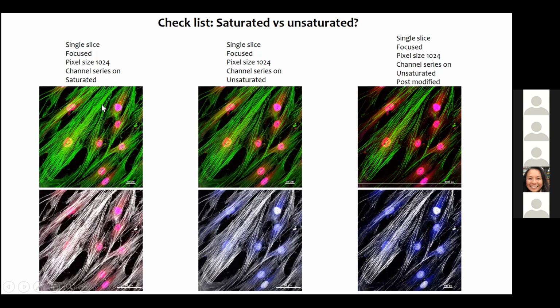The spot right here is going to be an oversaturated image. This is important because for the F-actin, you can get by with these kinds of images. But if you are seeing anything at a subcellular level, or at the surface of the boundary of the cell, then you do not want to have any kind of saturation, because again, it's going to misrepresent or misconstrue your data. So a good image would be where you have an unsaturated level here, so you can see the information that's being given off from these F-actin lines.